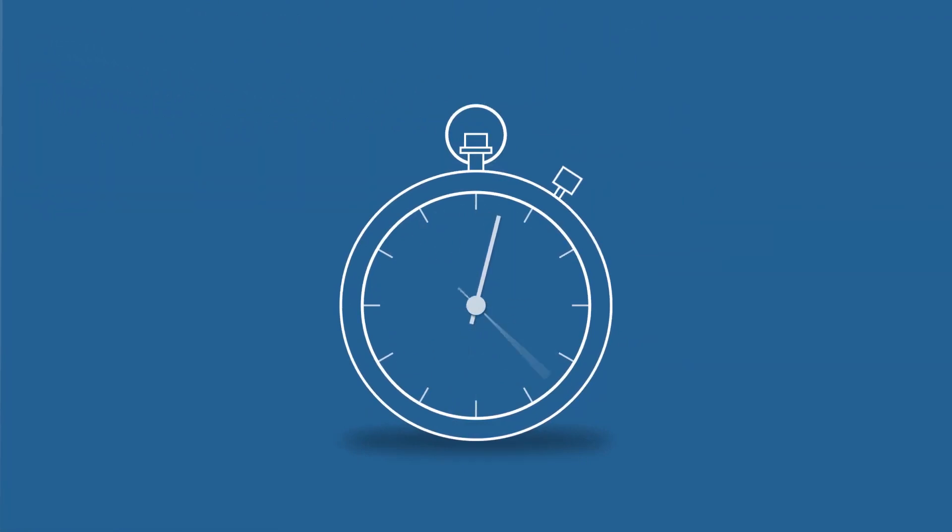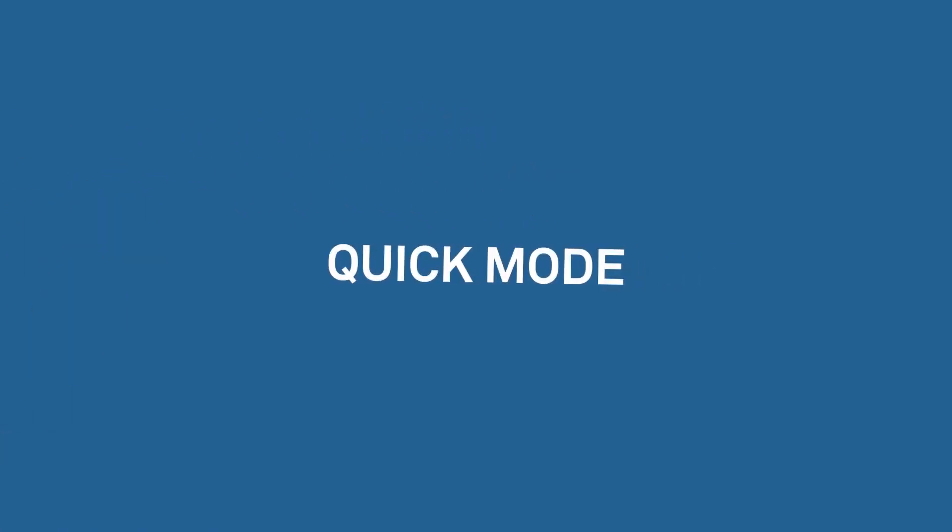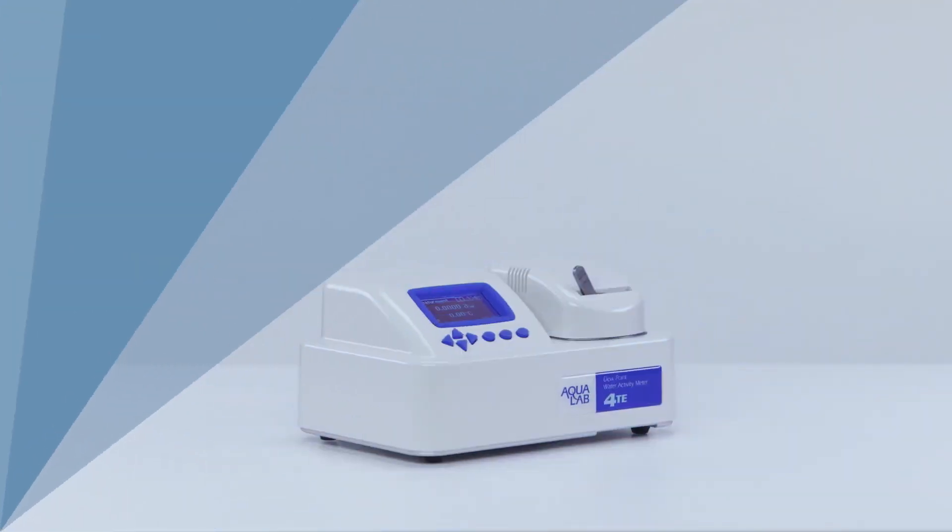Imagine a water activity meter that delivers a reading in five minutes. Not a quick mode reading or a prediction, but a direct measure of water activity accurate to 0.003. This is the Aqualab 4 TE.